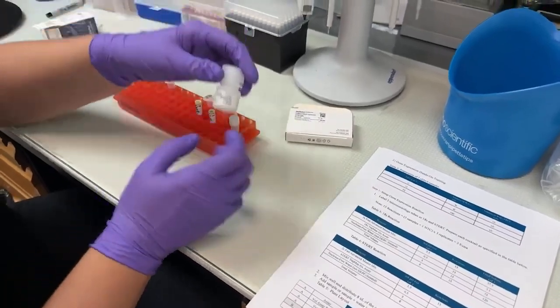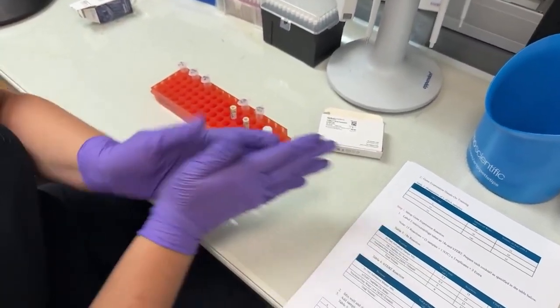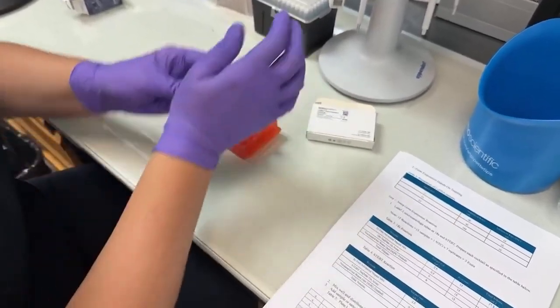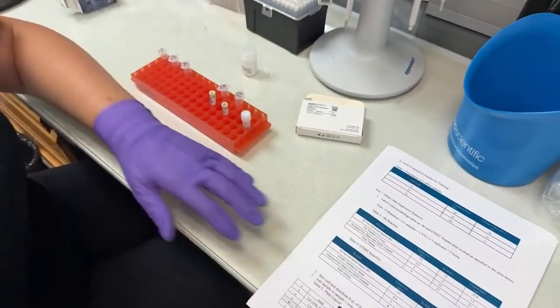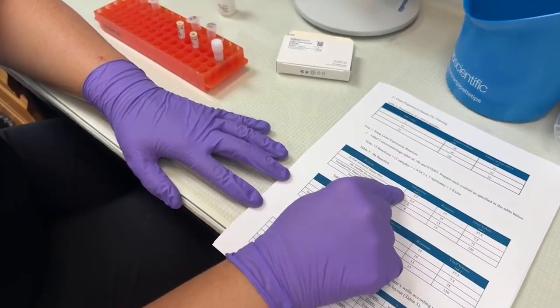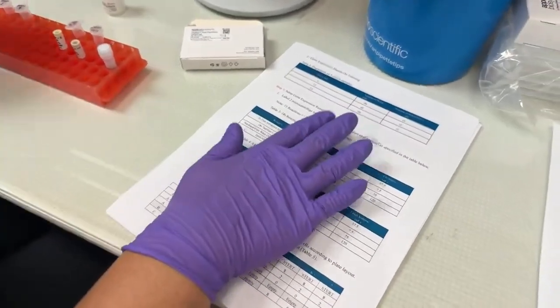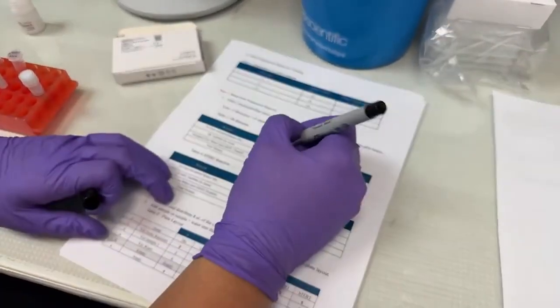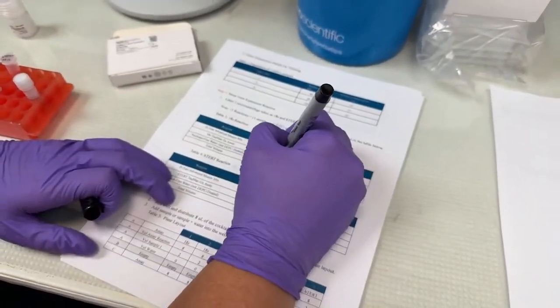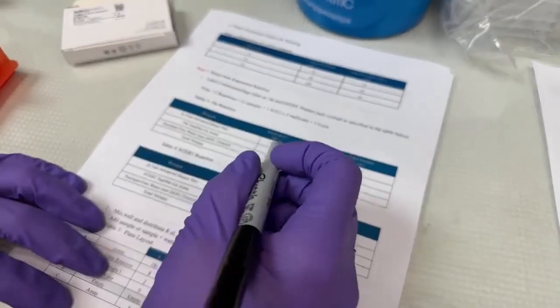First and foremost, we have that 2x Fast Advanced master mix. So here are the components for 1 reaction, which is going to be 2.5, is that right? That's not right. My math is wrong. We get to do this on the fly. Isn't that fun? So we have 5 microliters of our 2x master mix.